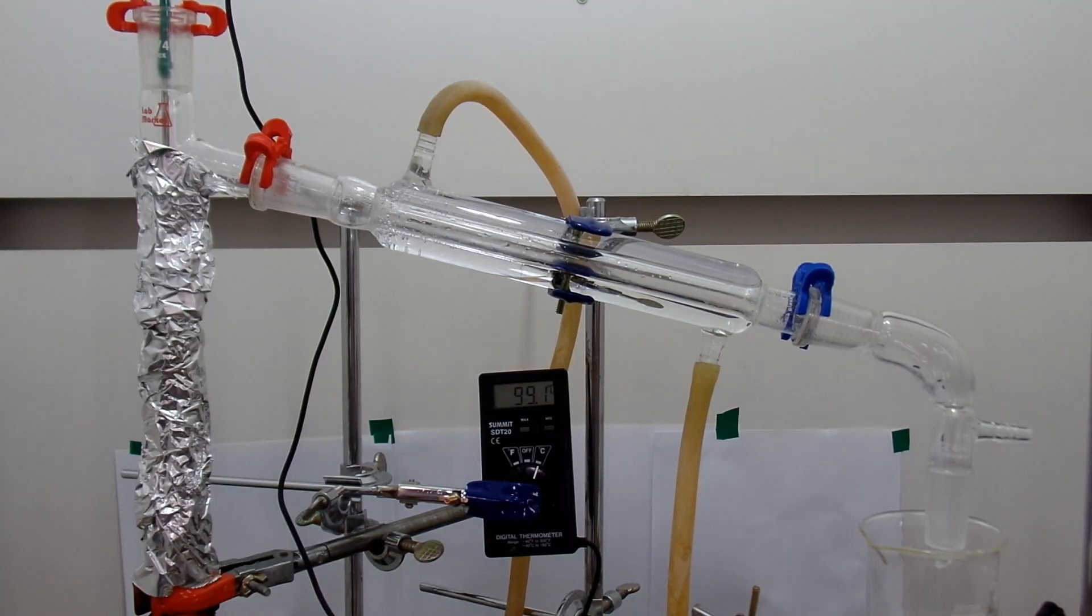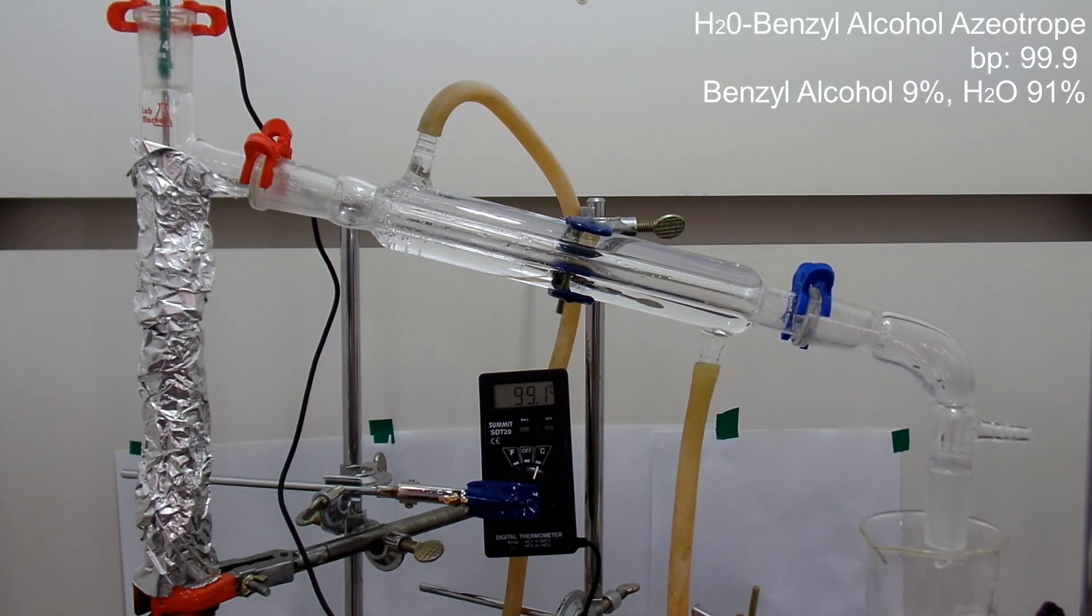So I did it with the same method, but there was a huge problem. Benzyl alcohol actually creates an azeotrope with water at 99.9 degrees Celsius. And that is frustrating because in the water-benzyl alcohol azeotrope, benzyl alcohol accounts for only 9% of the weight in the azeotrope.